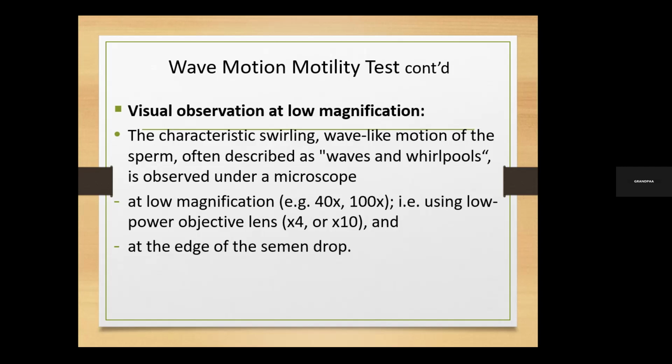A lot of people, because they don't use it, even sometimes just take it off. That is actually the situation on the ground. So if you don't have it, you have the times 10. That's okay. So you use the times 10 if that's what you have, and then examine the drop.